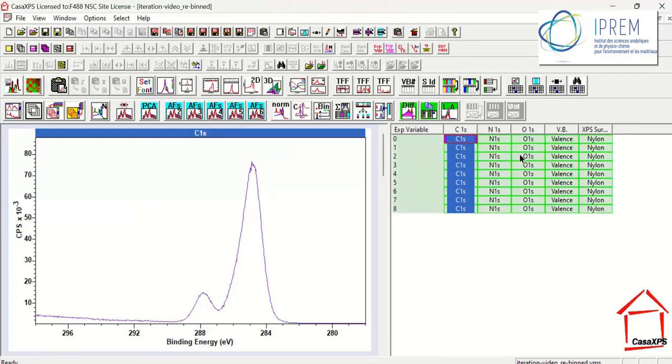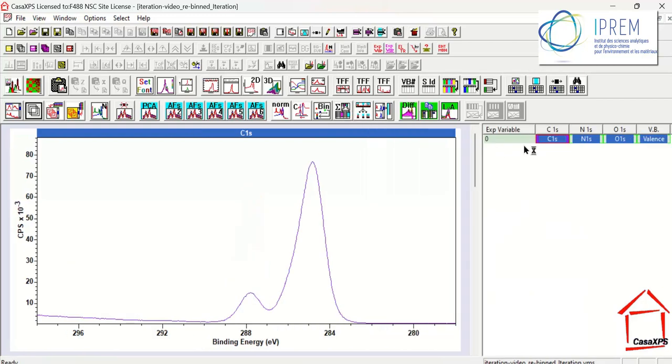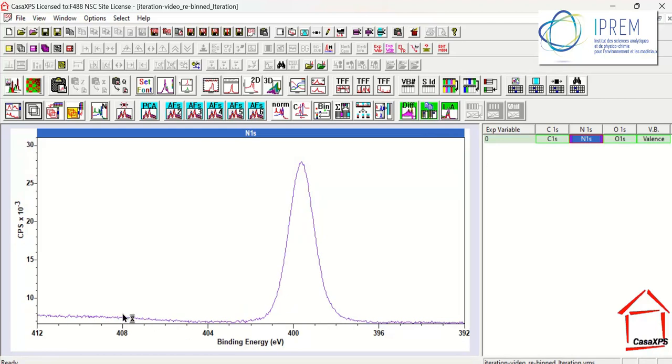It's within the raw data for these VAMAS blocks in the rebinned file, and that means that when I select, let's say, only the narrow scan spectra, if I wish to sum these rebin data, I can use the sum columns and produce a new VAMAS file which hopefully has better signal to noise and without damaging the resolution, because I've rebinned the signal to the data bins that all correspond to one another. Hence the spectra should be better signal to noise and easier to see that we've got a step, for example, in this nitrogen background.